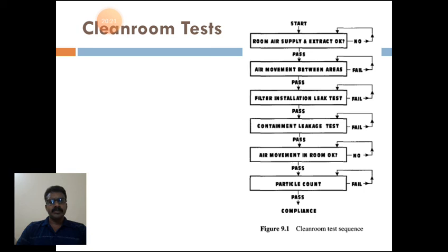First of all, clean room clothing. Large amounts of contamination are dispersed from people in clean rooms. Special clothing is therefore worn in all clean rooms to control the particles and microbiological dispersion from people, and hence the contamination within clean rooms. Clean room masks and gloves have to be worn.